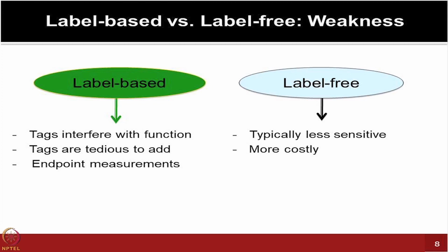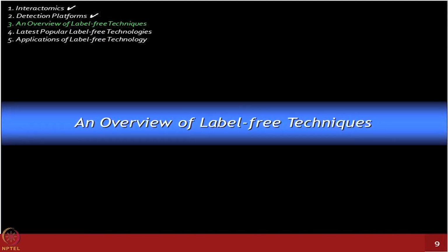They are sometimes more costly, and again you still have to ensure that all the signal which you measure is coming because of the actual binding and not because of the bulk effect, not because of something else which is happening and you are seeing an artifactual response. So many of the things are still in a more infancy, early developmental stage, which needs to be tested out well.